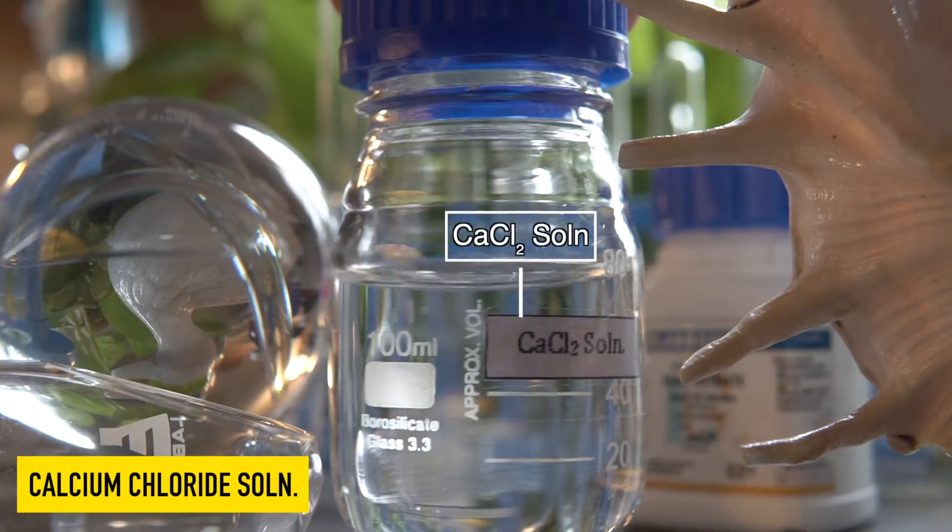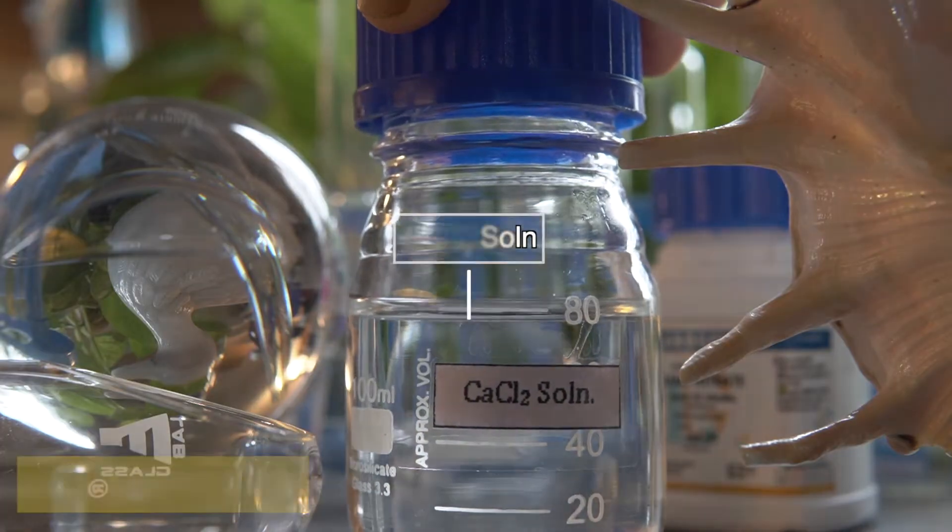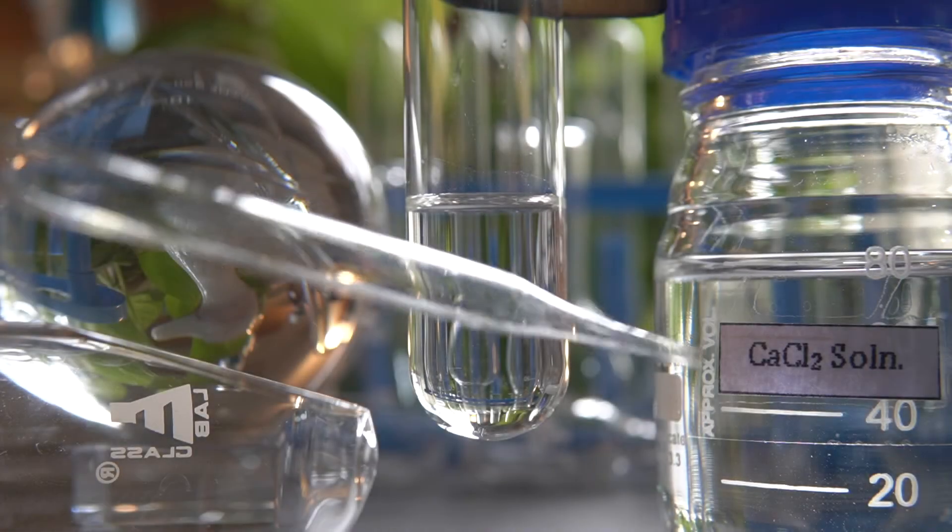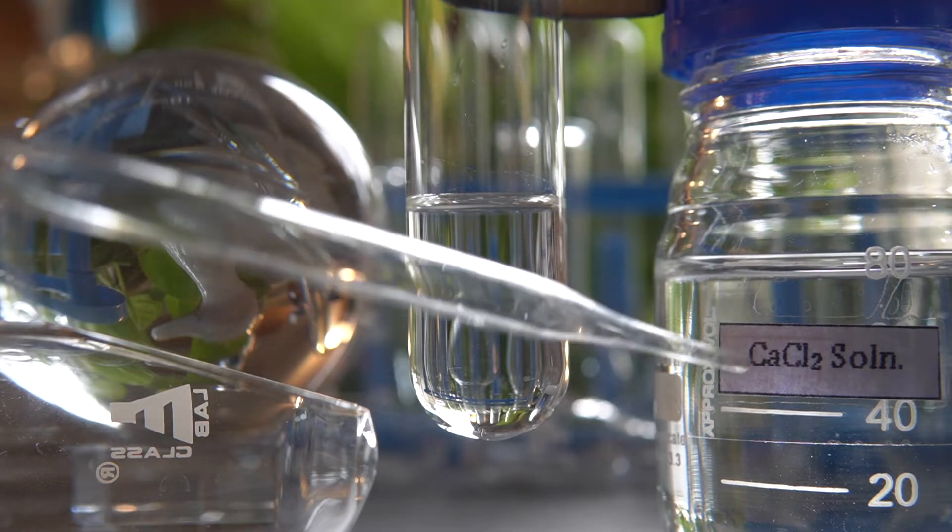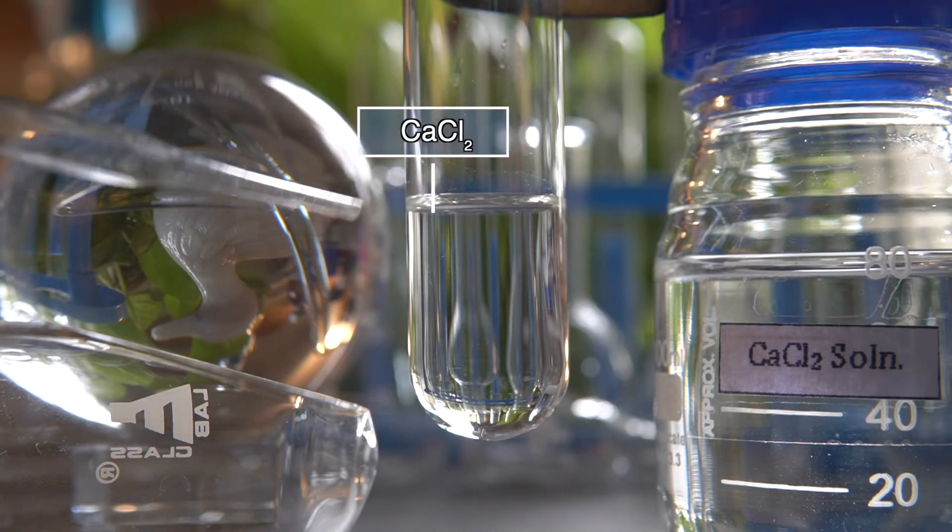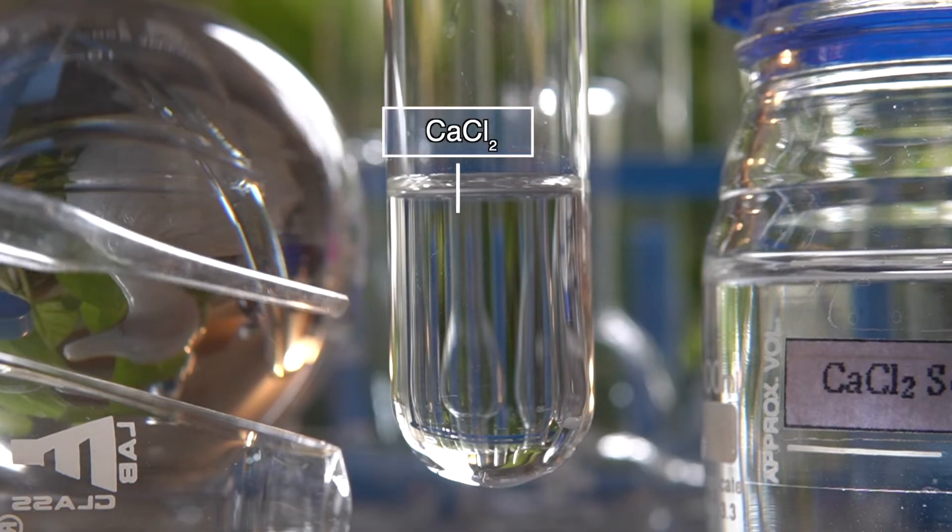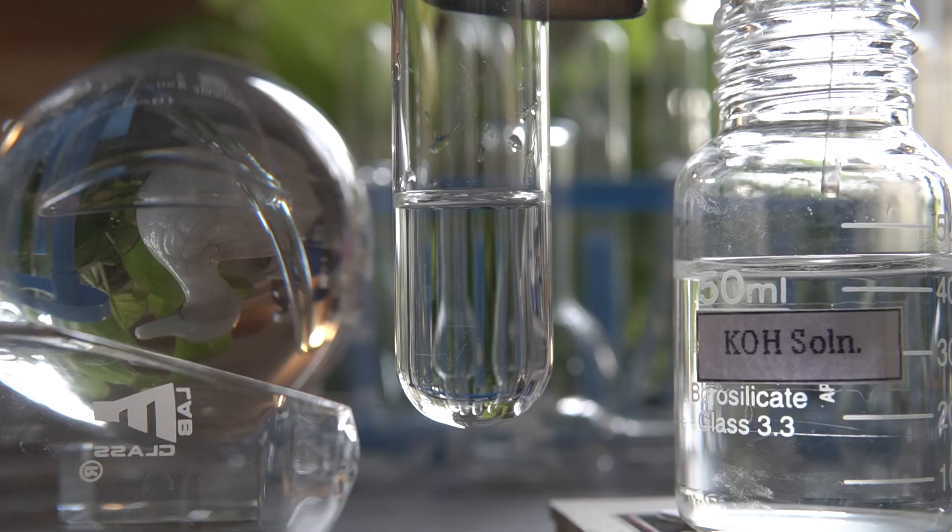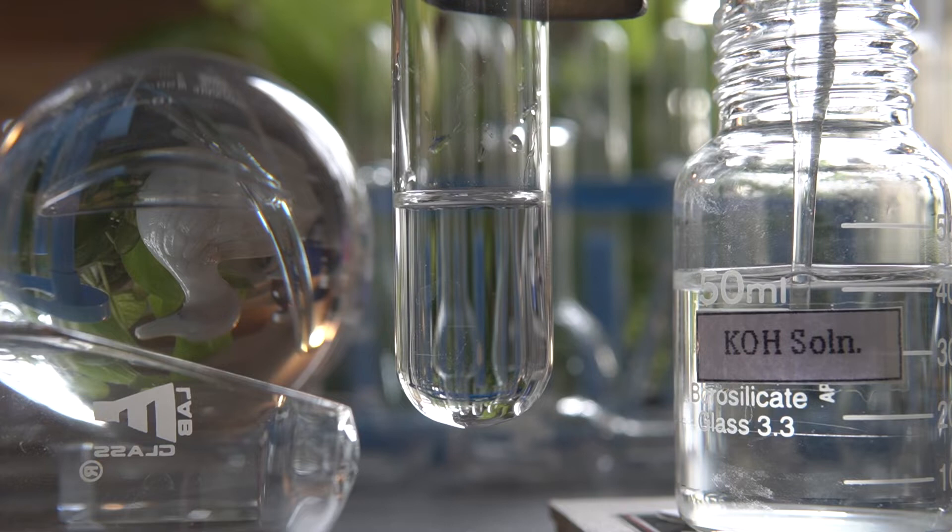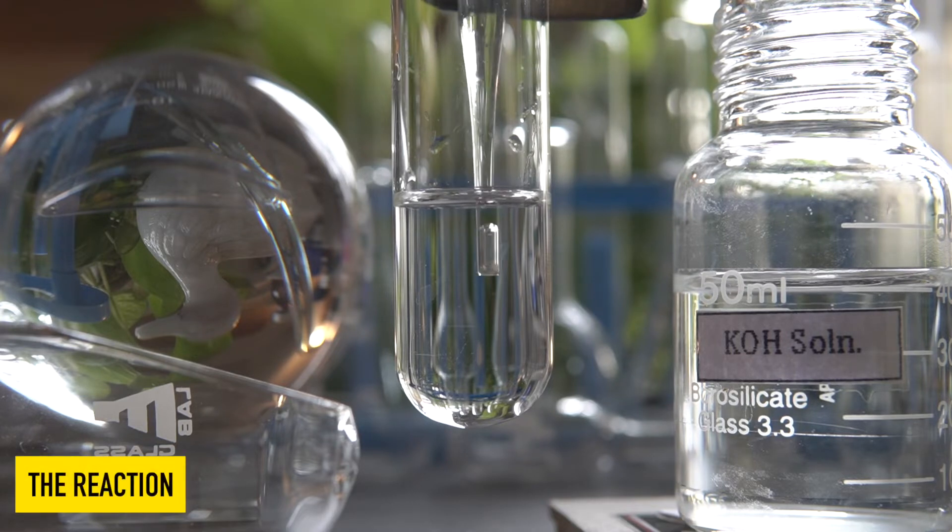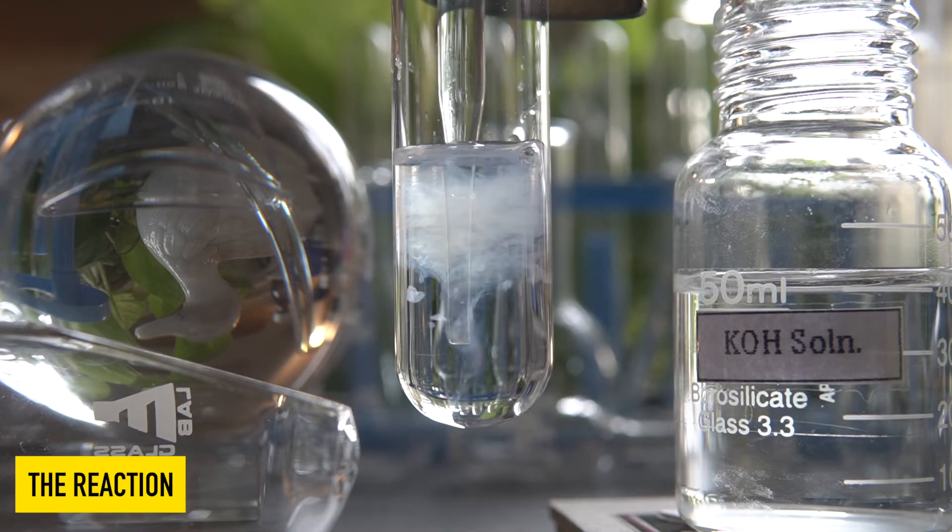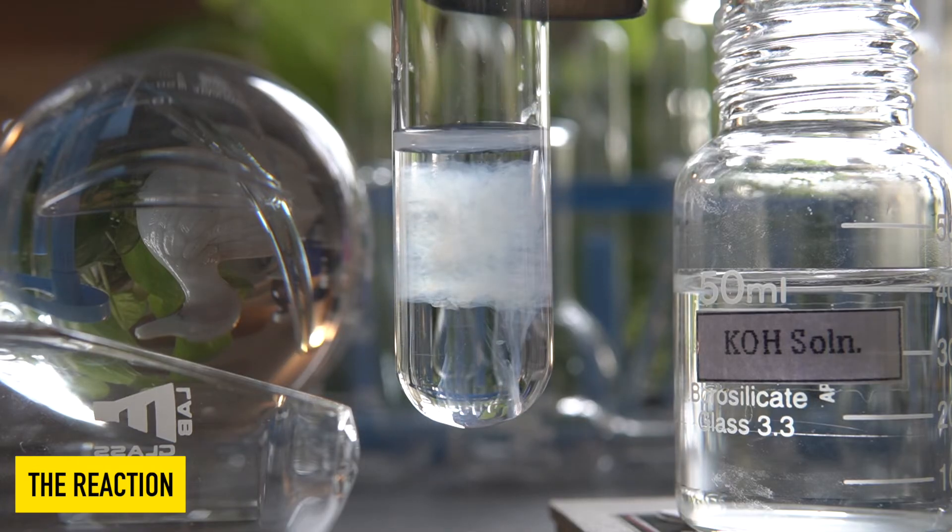Now to initiate the reaction, we will take some amount of the calcium chloride solution into this test tube. Add KOH or potassium hydroxide solution into the calcium chloride or CaCl2 solution slowly and observe the effect.